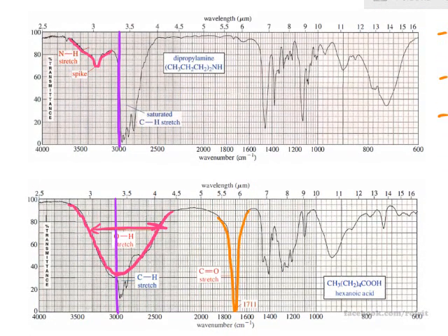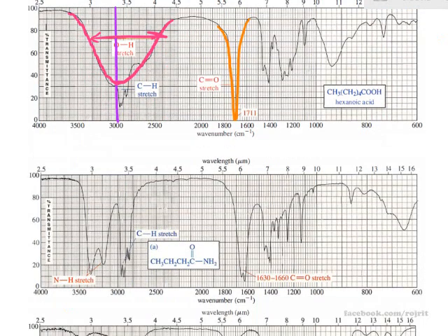So it would be different from a hydroxy ketone. If you have a hydroxy ketone, you would have the carbonyl and the OH of the hydroxy group of the alcohol, but the OH of the alcohol would be like this. If you have the OH shifted to the right, like this, it is the carboxylic acid. So you have to distinguish between carboxylic acid and hydroxy ketone. Not very easy, not very difficult.